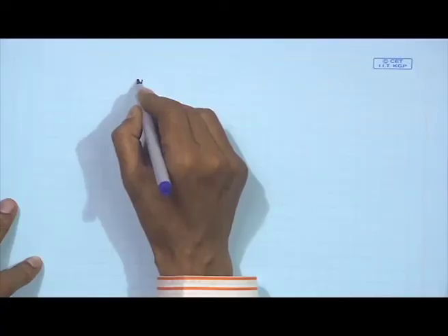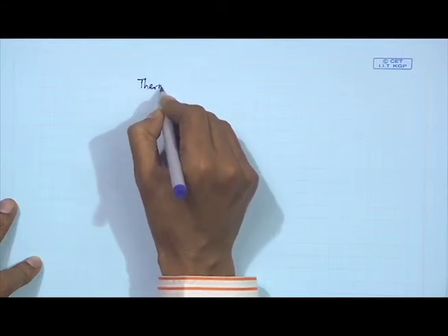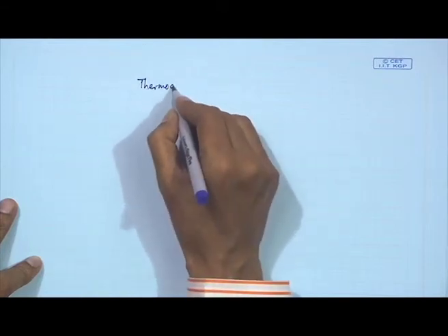So, in another way we can also call this process a thermo-analytical method.